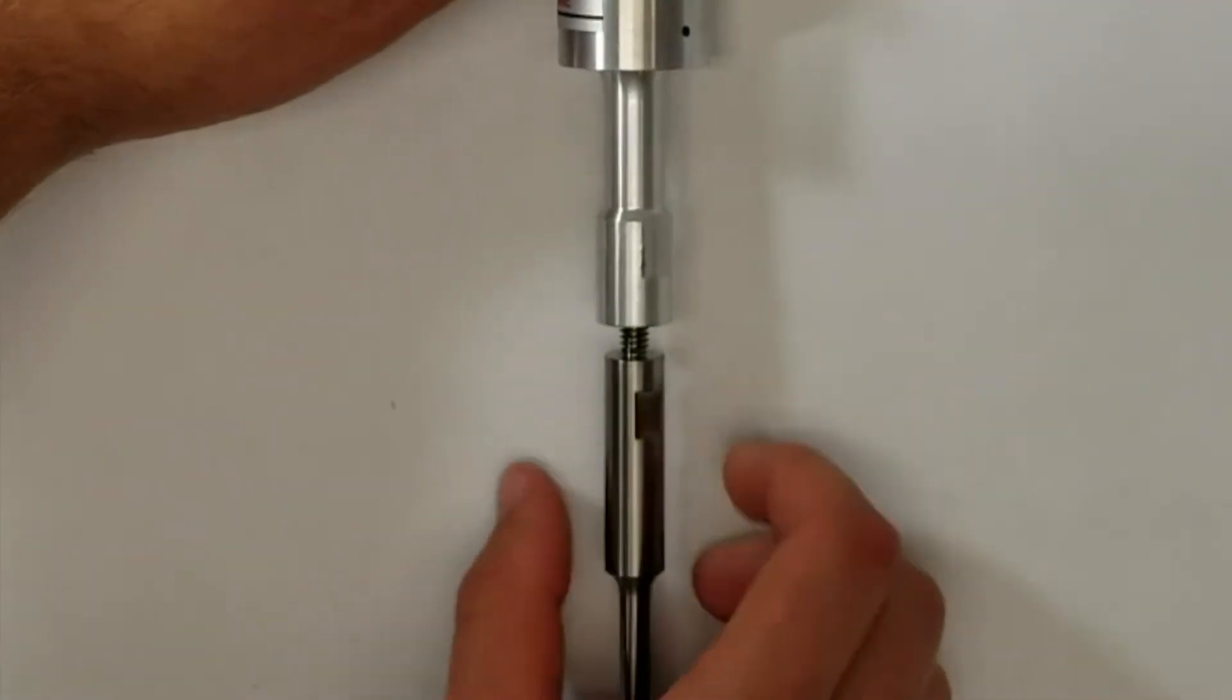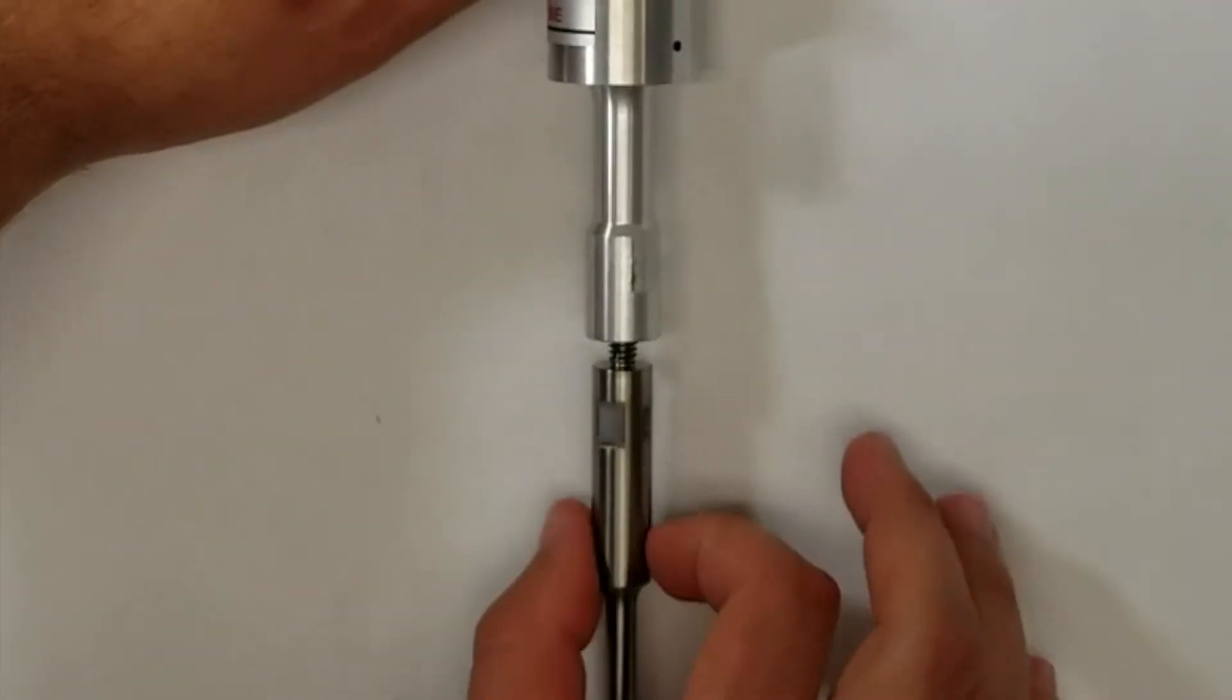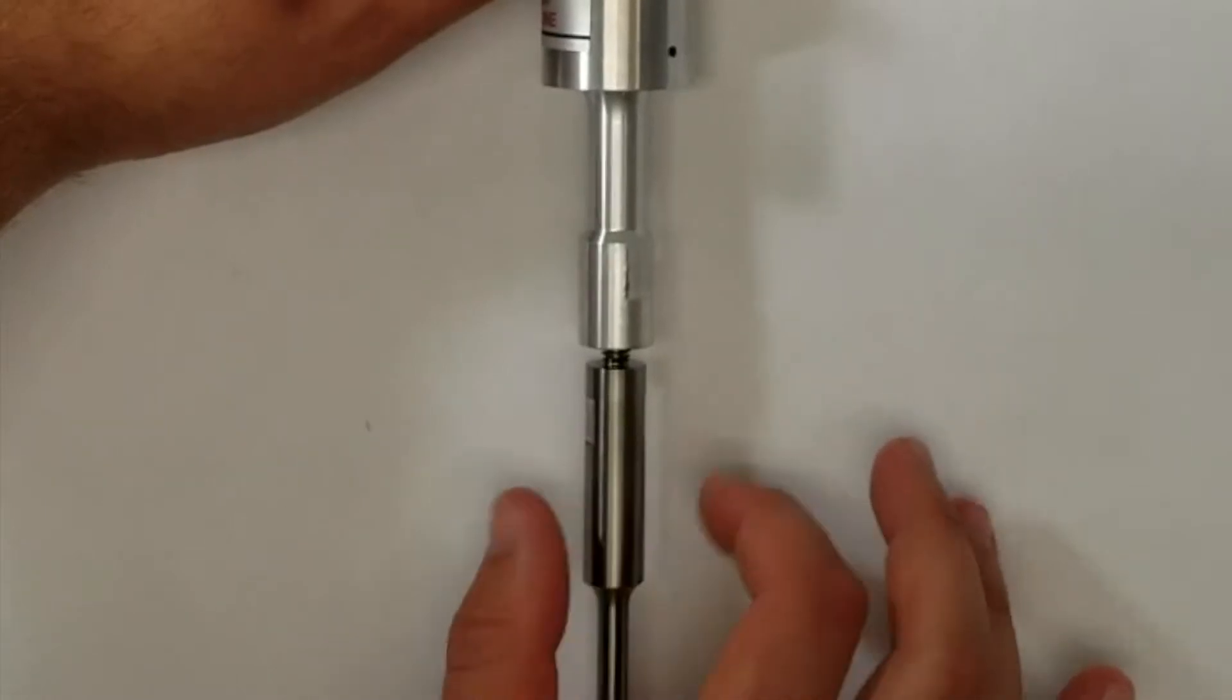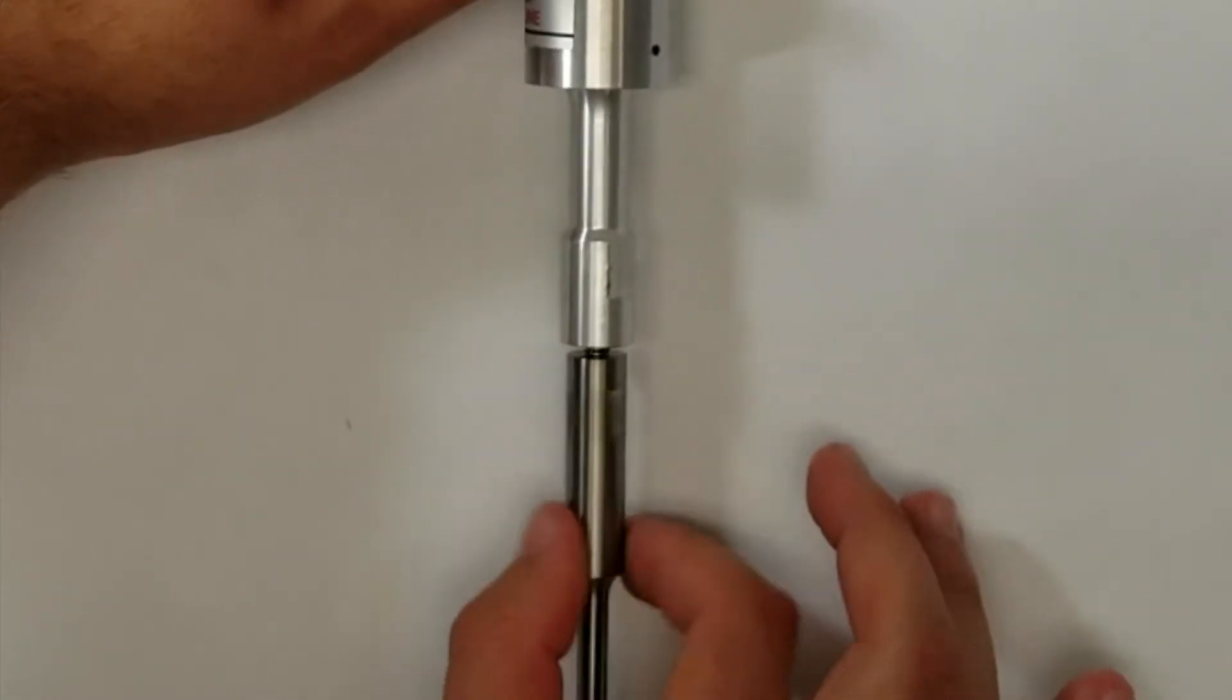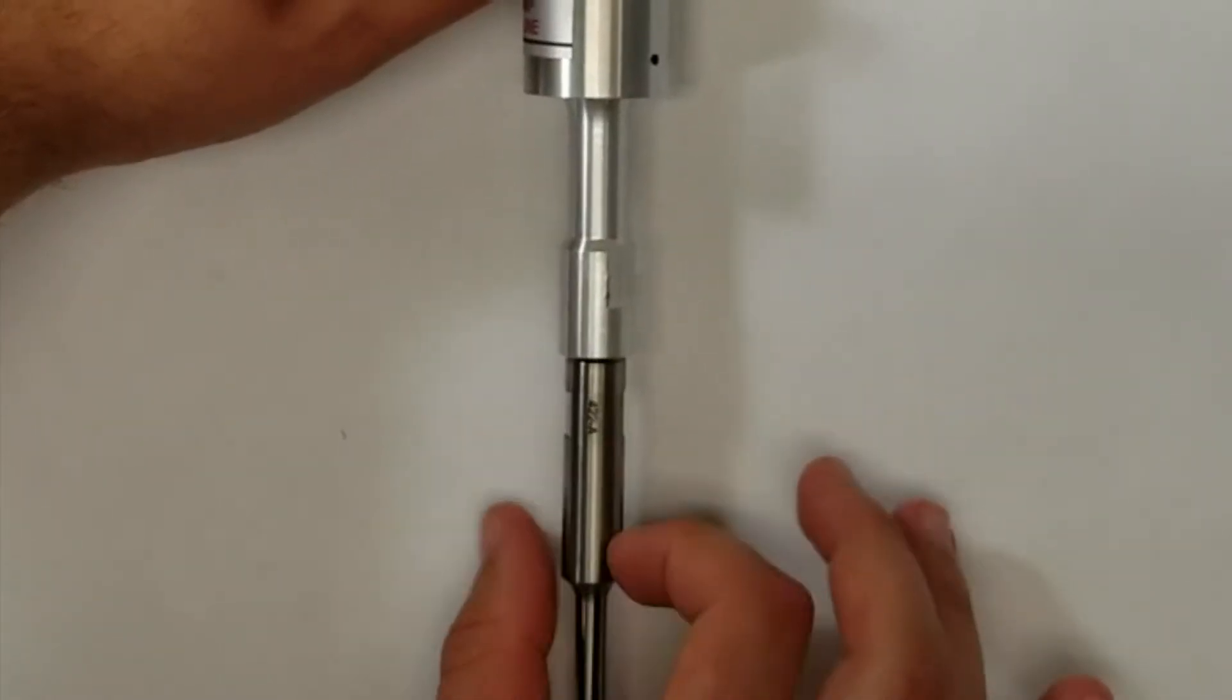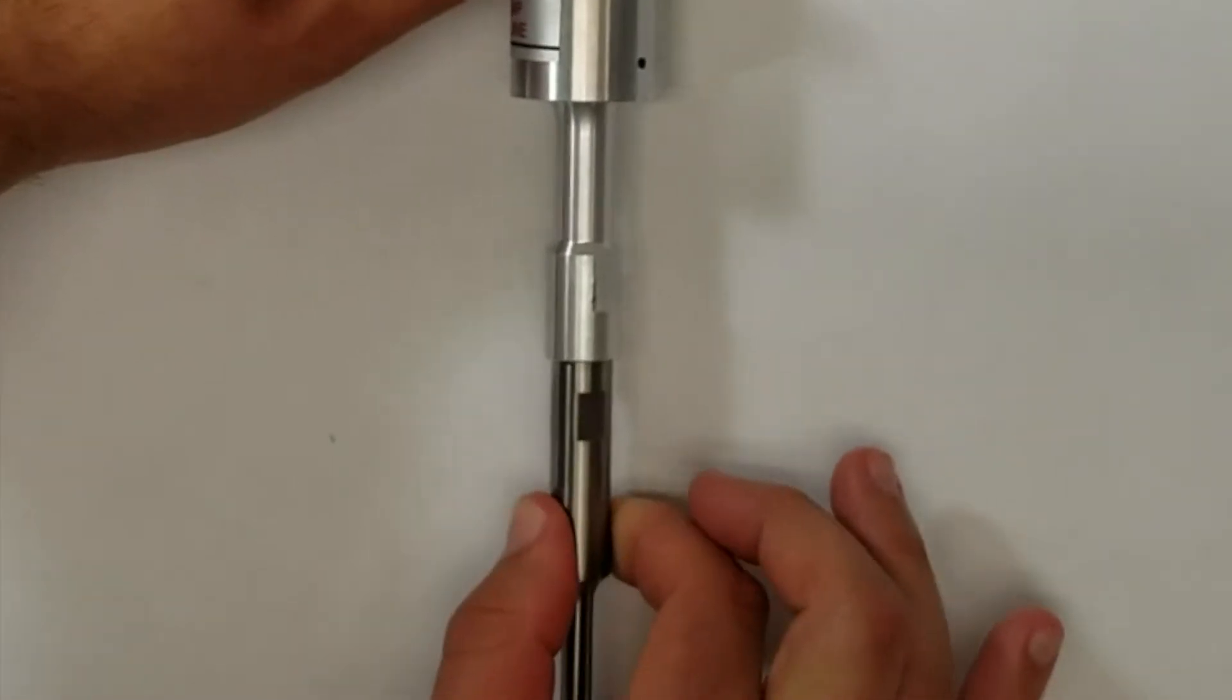The thread should engage easily and spin freely in the threaded hole. No force is necessary. If there is resistance, remove the probe and check the probe stud and the converter hole for debris.